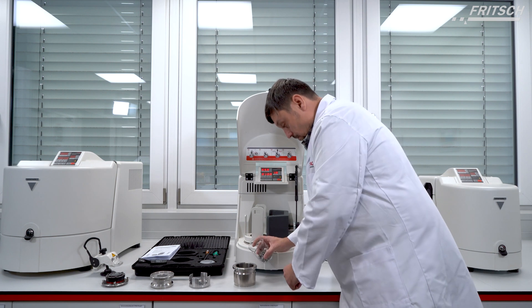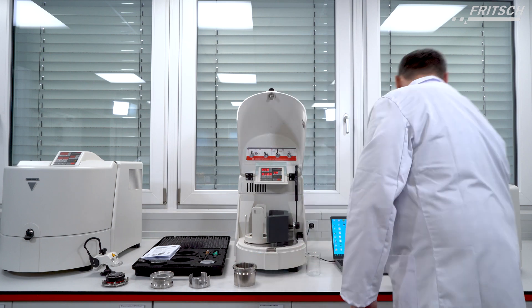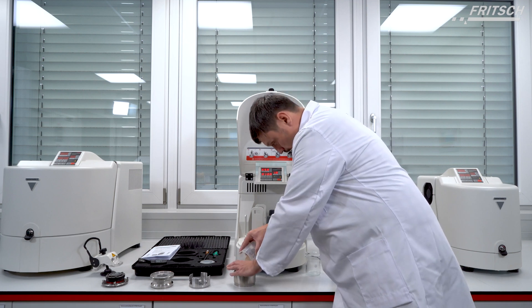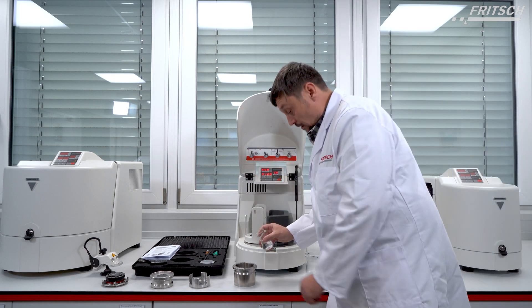We use some grinding balls, 10 mm, 50 pieces of them. We have here our silica sample and we have isopropanol alcohol.